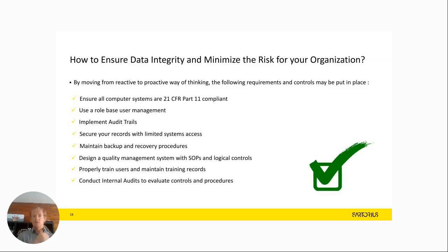Okay. And then for your instrument, use a role-based user management. Implement complete undeletable audit trails. Secure your records with limited system access. Goes back to the role-based management. Maintain backup recovery procedures. Design a quality management system with SOPs and logical control.